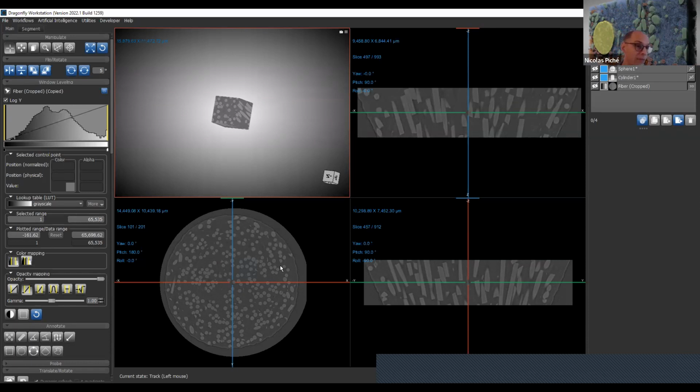We used to have that, but in industrial, there's like 1 out of 1,000 that wants to do that, but we already have the code, so sometime I will be forced to do it, I suppose. So stay tuned. Maybe next December or the release after it may be required for me to do curved planar reformat. It's a lot of code.